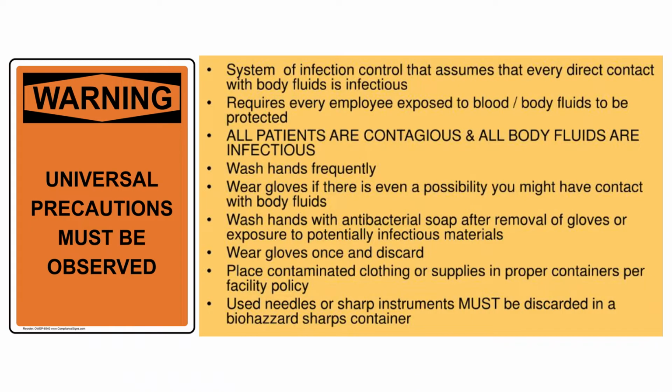As clinical laboratory personnel, we all know that given the nature of the work and the things that we perform inside the laboratory, we are exposed daily to different potential hazards, not just limited to contagious and infectious body fluids, right? We can also be exposed to electric shock and the inhalation of toxic vapors from the reagents that we use in the laboratory.